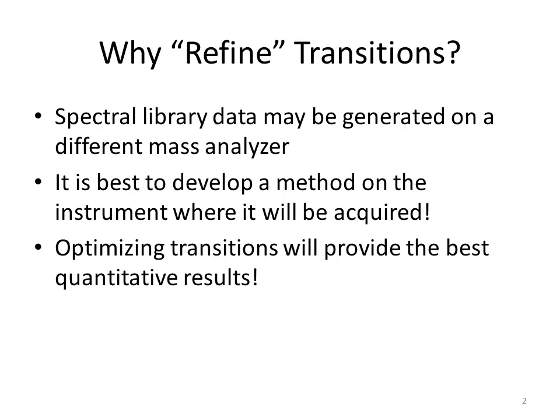When we want to try to quantify something, now we have to start thinking about generating enough points across our chromatographic peak so we can properly calculate a good peak area and its reproducible injection to injection. So we need to make sure all of the bits and pieces of these peptides we're monitoring are good for the instrument that we're using them on.